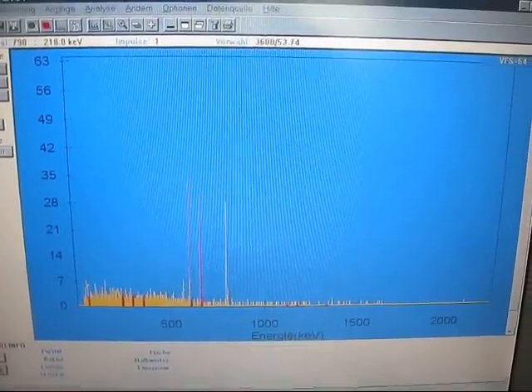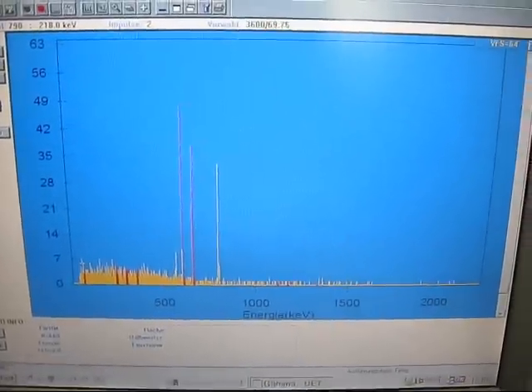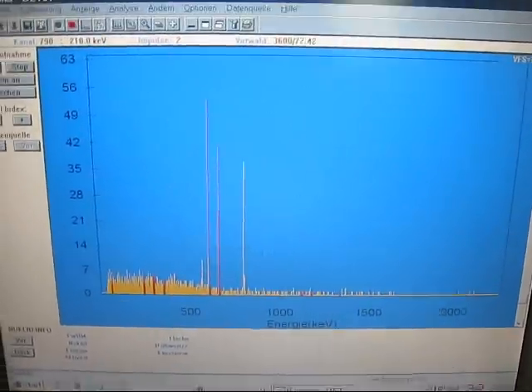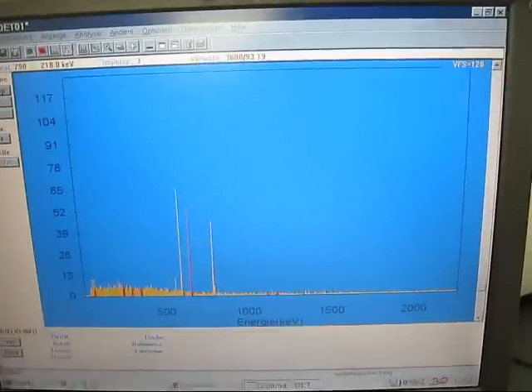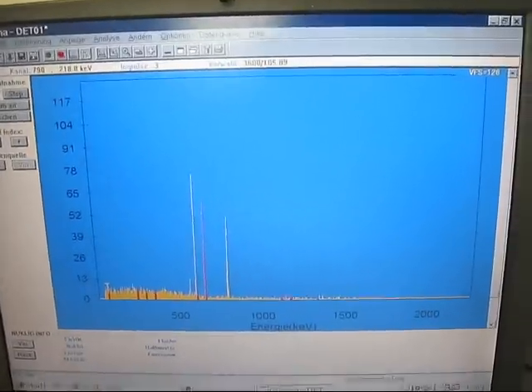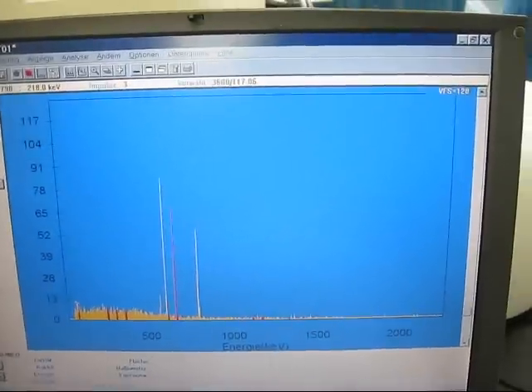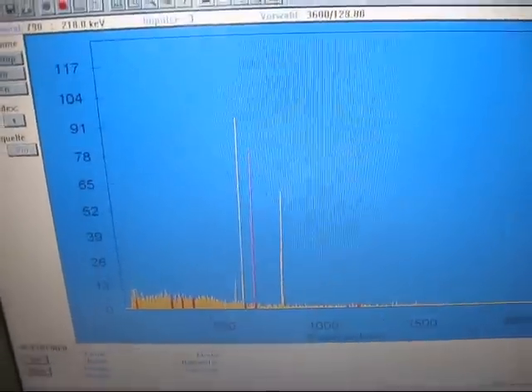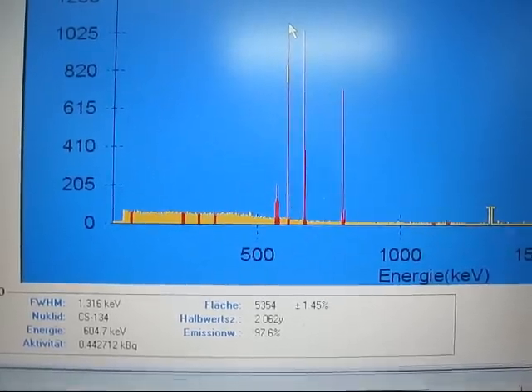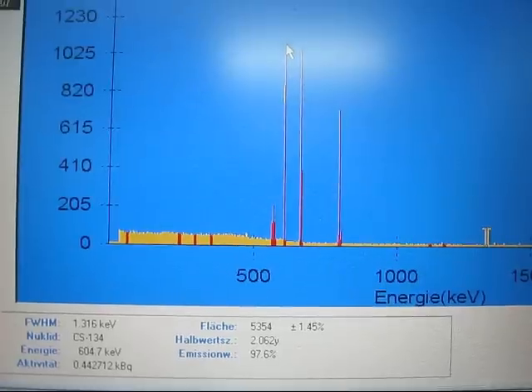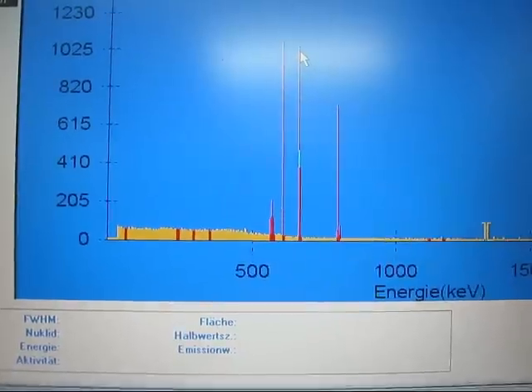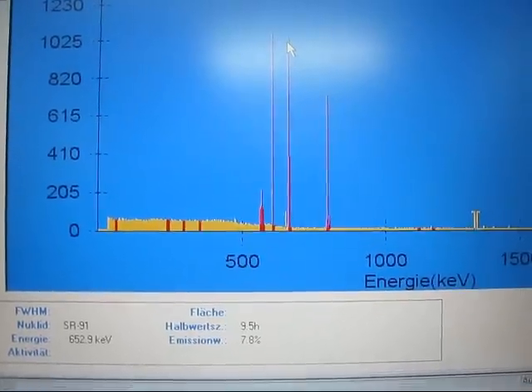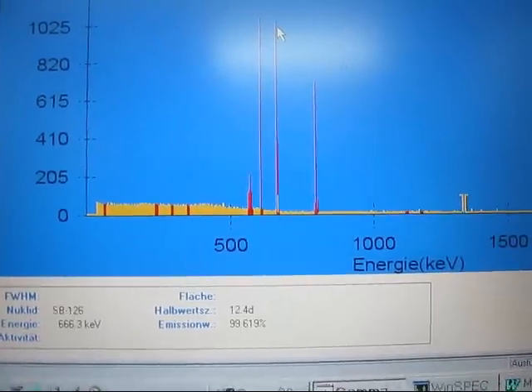Speeding things up, you can actually see how more lines are coming up. This was actually just a 30-minute analysis, but we had the sample analyzed for a full 24 hours, and all we could see on the gamma spectrometer was the lines that belong to cesium-134 and cesium-137. Now let's have a look at the peaks, and we can see that this peak here is responsible for cesium-134. Now we're just browsing through the peaks to see what the analyzing software says.